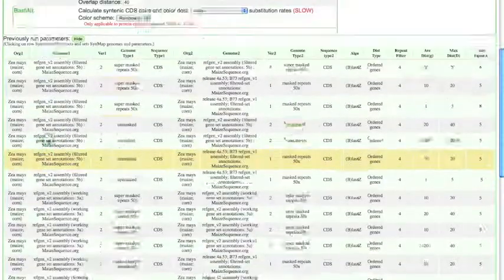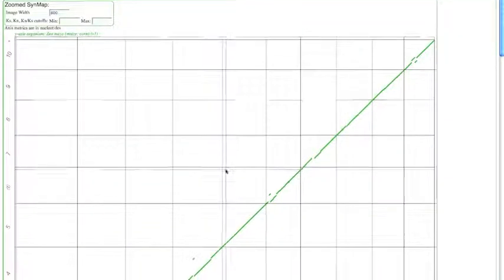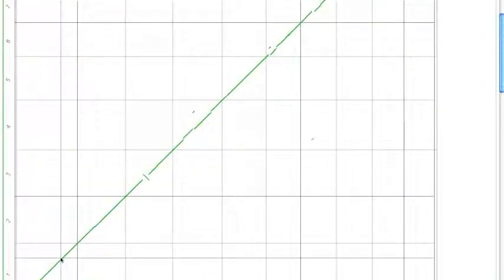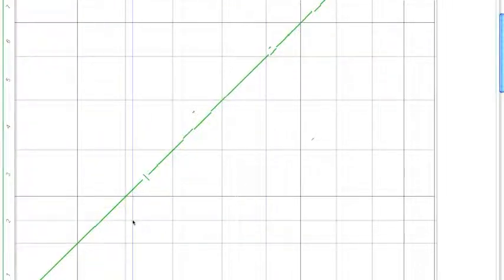In this case, we're interested in identifying the syntenic regions that give us the best coverage once between these two genomes. So we need a syntenic depth coverage of 1:1 between these two genomes. When the results are returned, we'll see now that we just have that nice 45-degree line, all the chromosomes are ordered by size, and we've removed all of the other syntenic regions from this analysis.